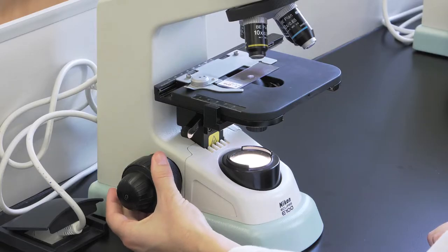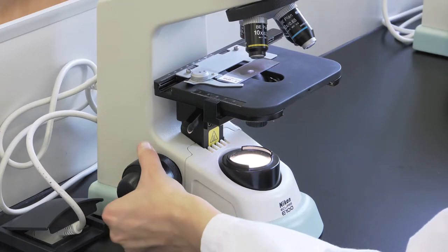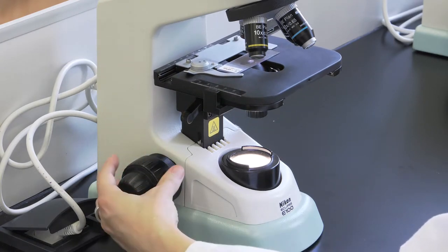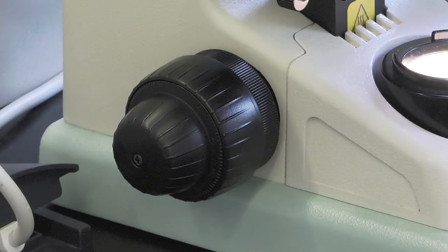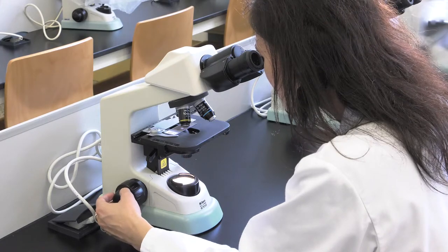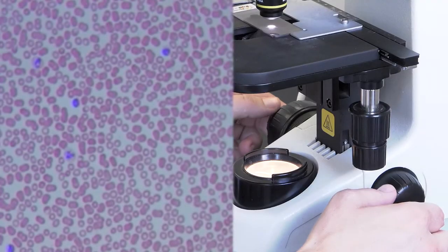The outer one is the coarse focus knob. It makes large displacements of the stage. The inner one is the fine focus knob and serves for carrying out small displacements of the stage. That is why it is used for focusing the sample with great precision.